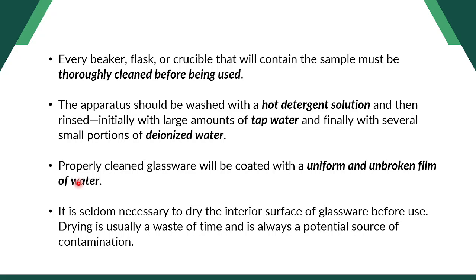Kung kanang mag-washing ta og sakyanan, ang tubig kay pantay, wala gyud sila nagbadlis-badlis, walay mga sangit, because that can give us an assurance nga the surface of these glasswares are free of contaminants.